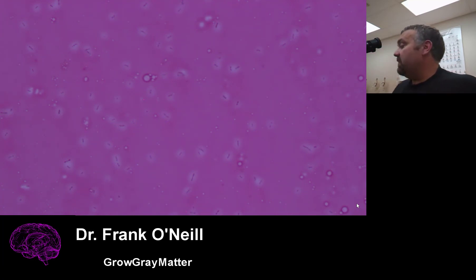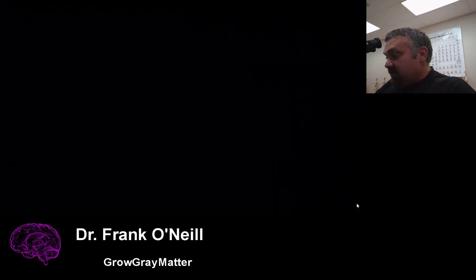All right, so now I'm going to move to the oil immersion objective. If this is the first time you've seen me do this, the screen's going to go black because I'm actually going to go between the two objectives. I'm going to put a single drop of immersion oil on the slide. Then I'm going to slowly and carefully move the oil immersion objective over my slide, making sure the objective and stage aren't too close or the slide will break.